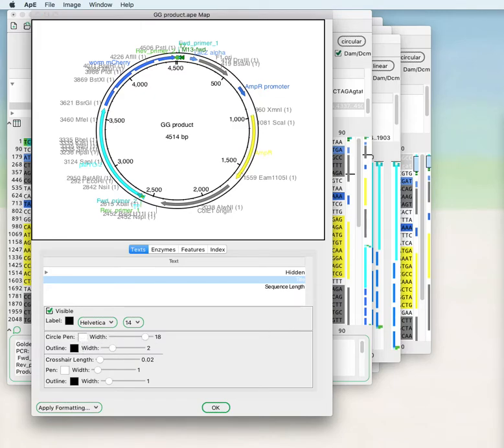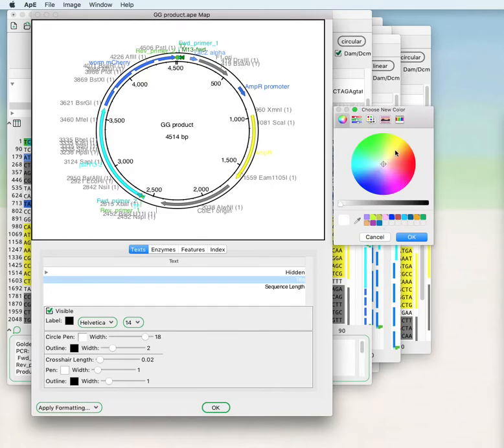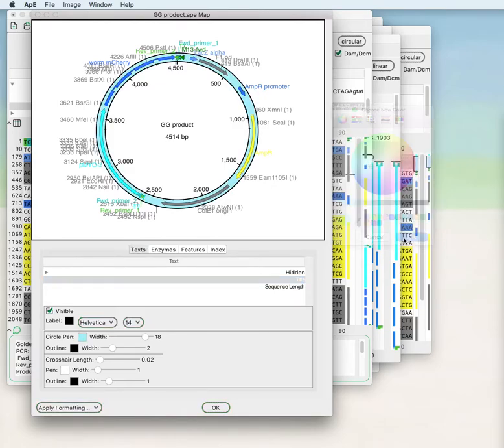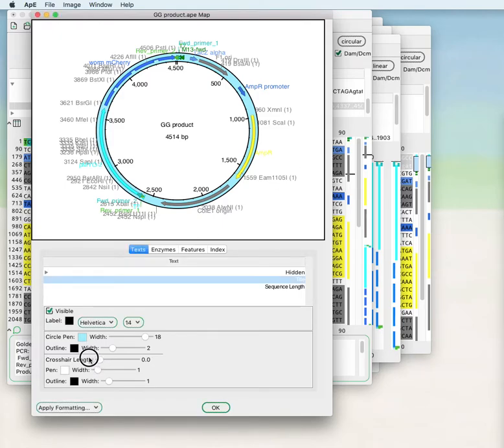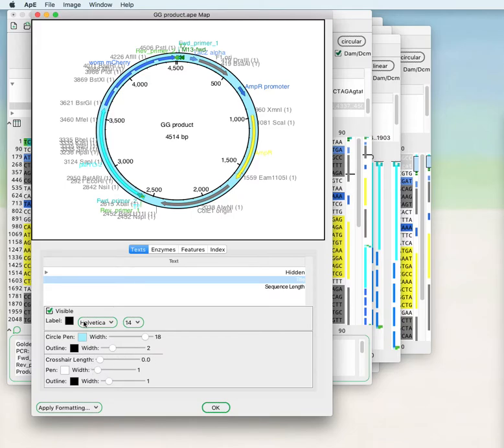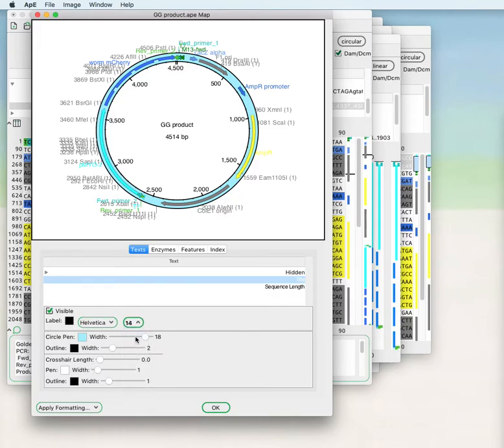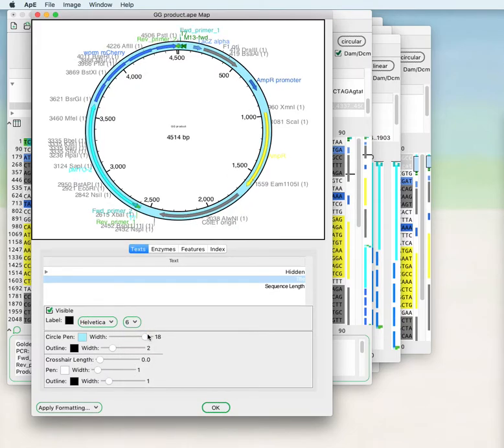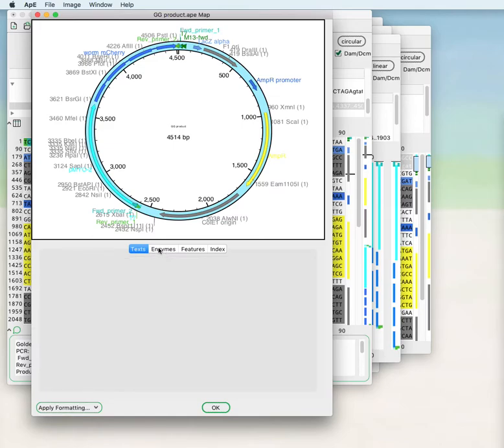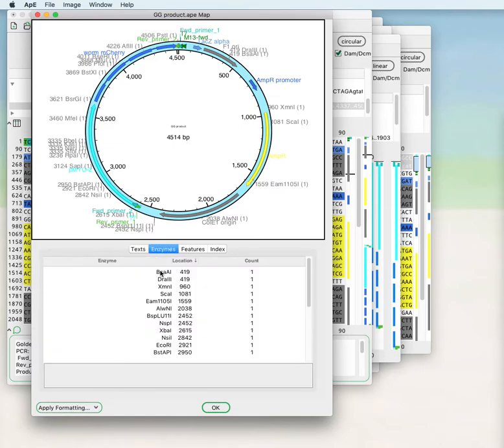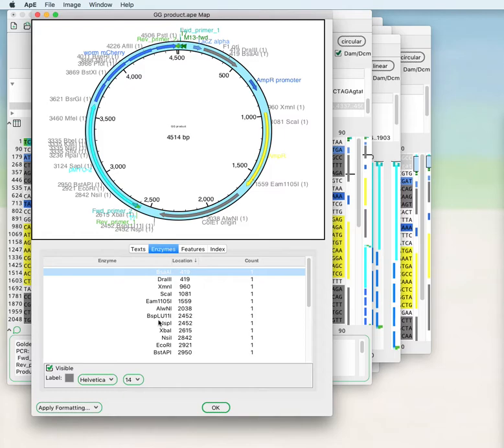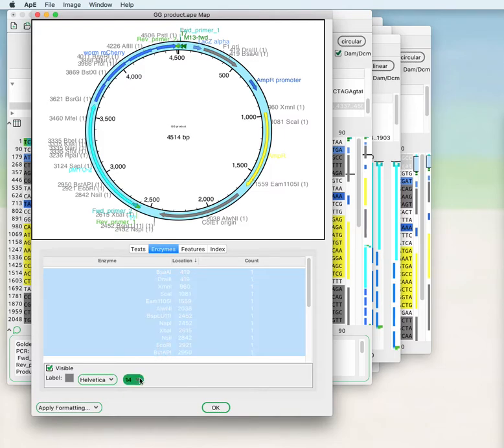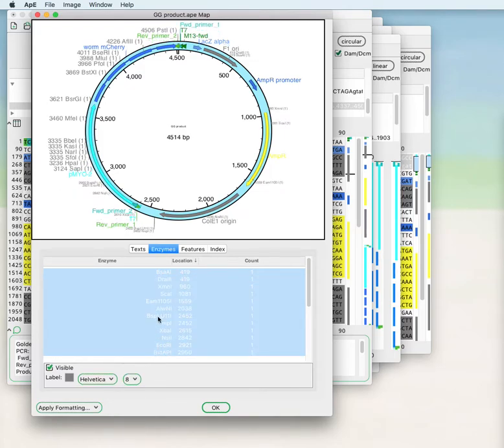You can change the color. You can change the crosshairs, taking them off or making them more prominent. You can make the text smaller. Similarly, you can change the text values, making these smaller or changing the font or changing the color.